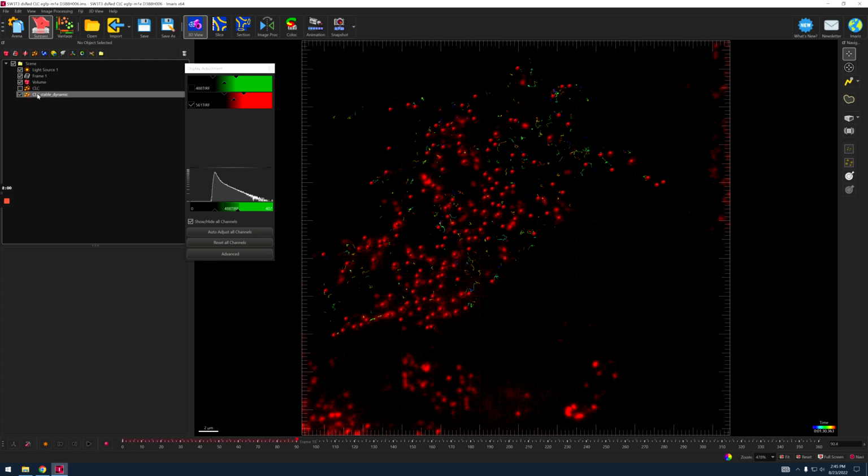I already created this stable and dynamic clathrin light chain module, and this is to remove the clathrin light chain spots that appeared before we started imaging and then disappeared at some point during our imaging.